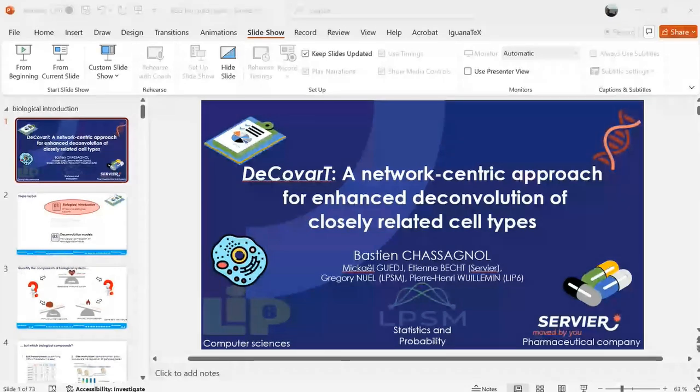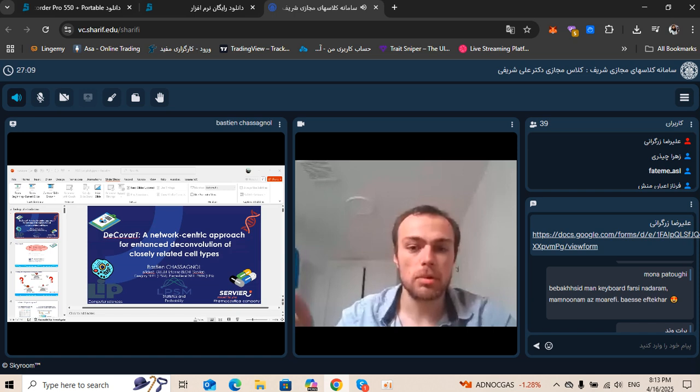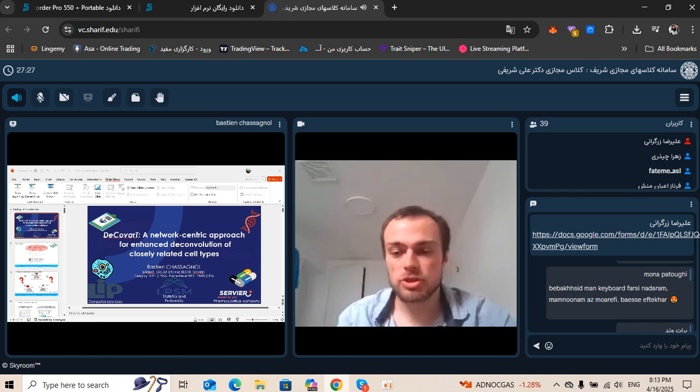Okay, so when you are doing standard bulk transcriptomic analysis, you're going to go through all these stages. Usually you have a stage of data management where you come up with an expression set. Then you have a data quantification stage, in which the key steps are the removal of the background expression, so the genes that remain unexpressed, the discarding of low quality samples, for example the ones that poorly overlap with other samples, normalization, and transformations.